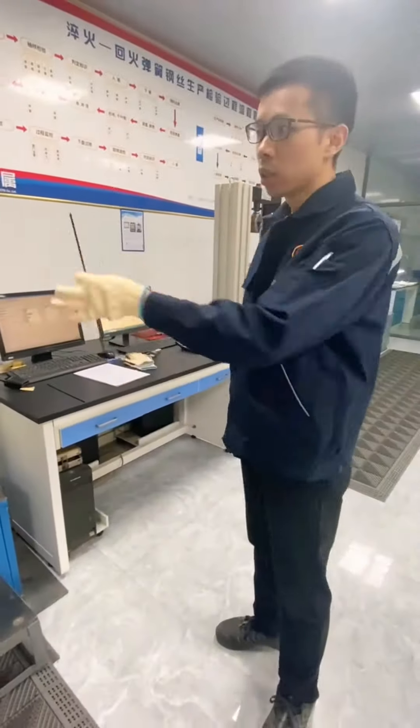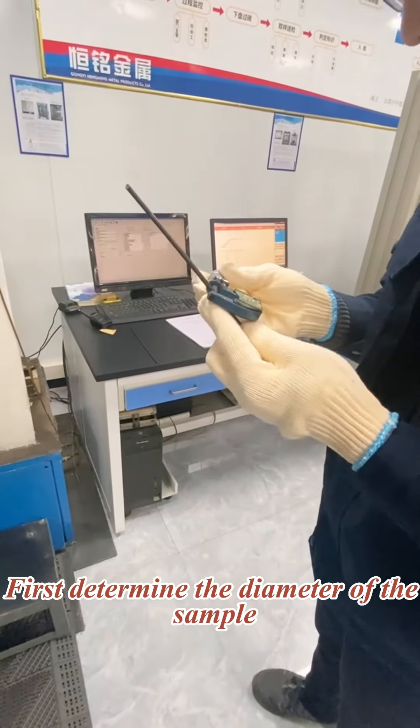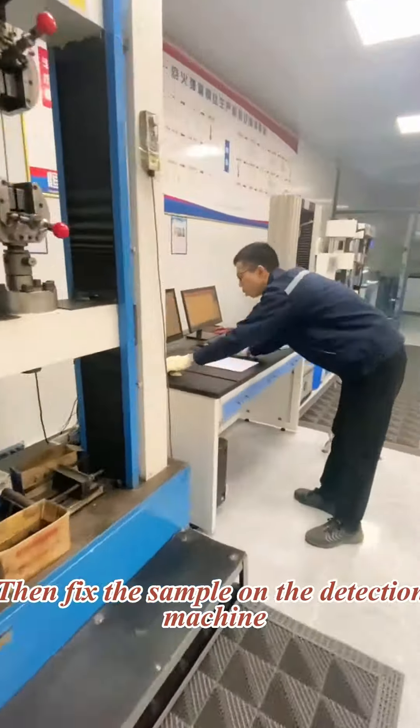Today, let's take a look at the spring tension detection. First, determine the diameter of the sample. Then fix the sample on the detection machine.